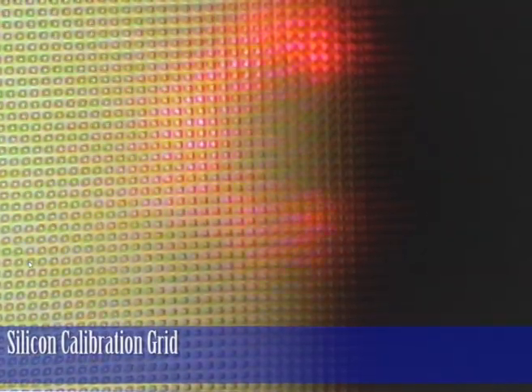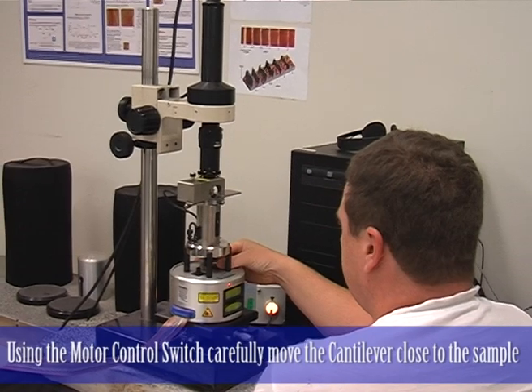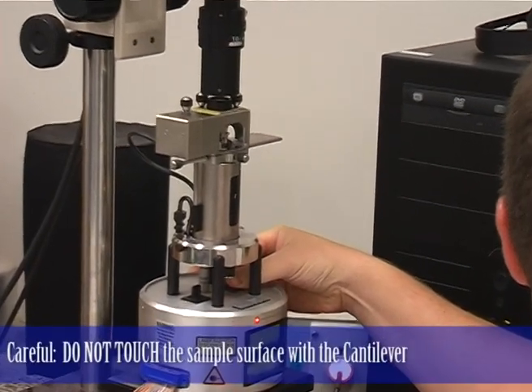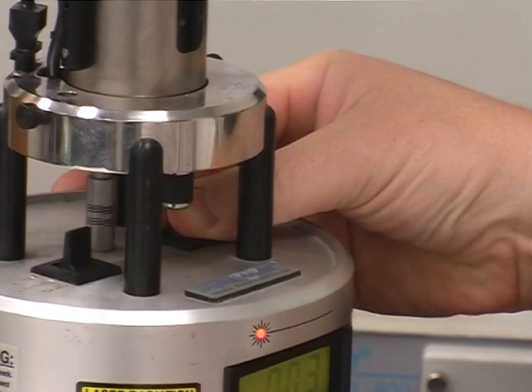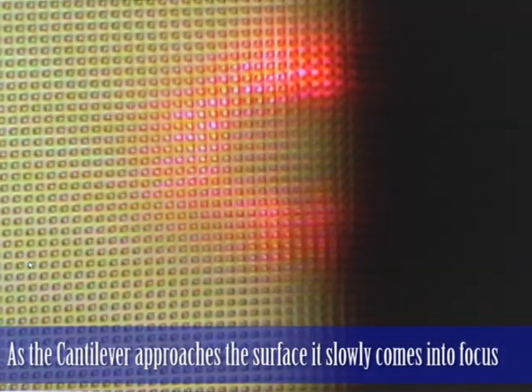I'm now going to bring the cantilever down so it's close to the surface while not bringing it so close that it touches. You'll see the cantilever start coming into focus as it gets closer to the surface.